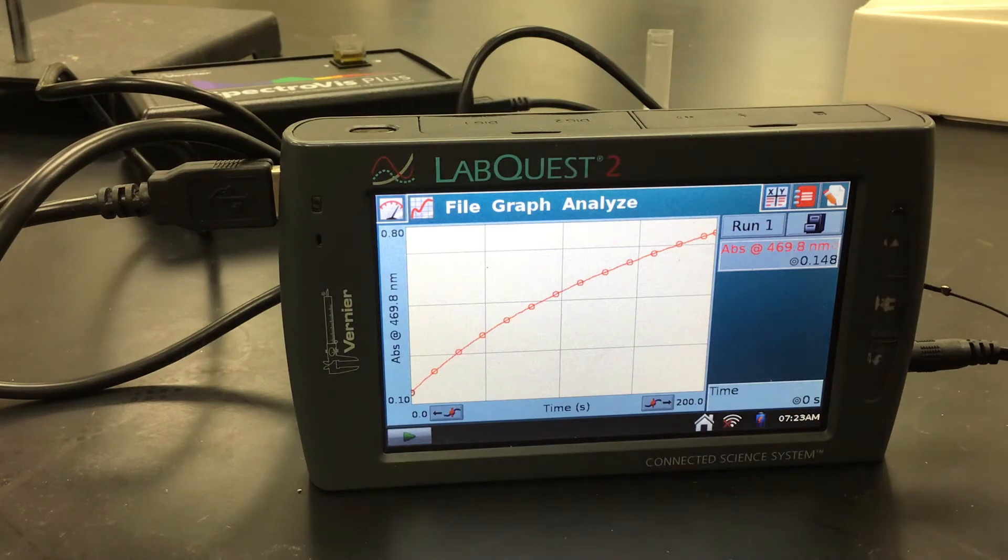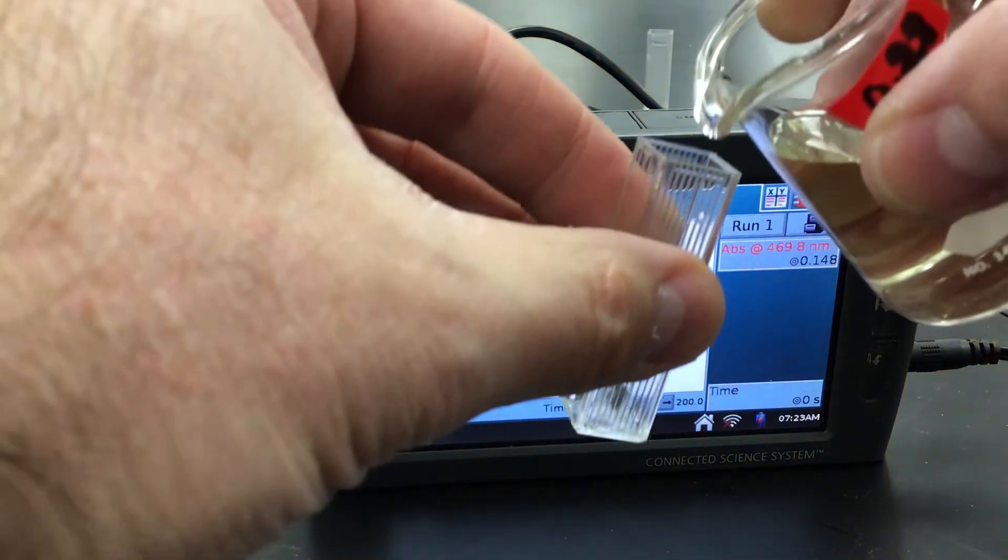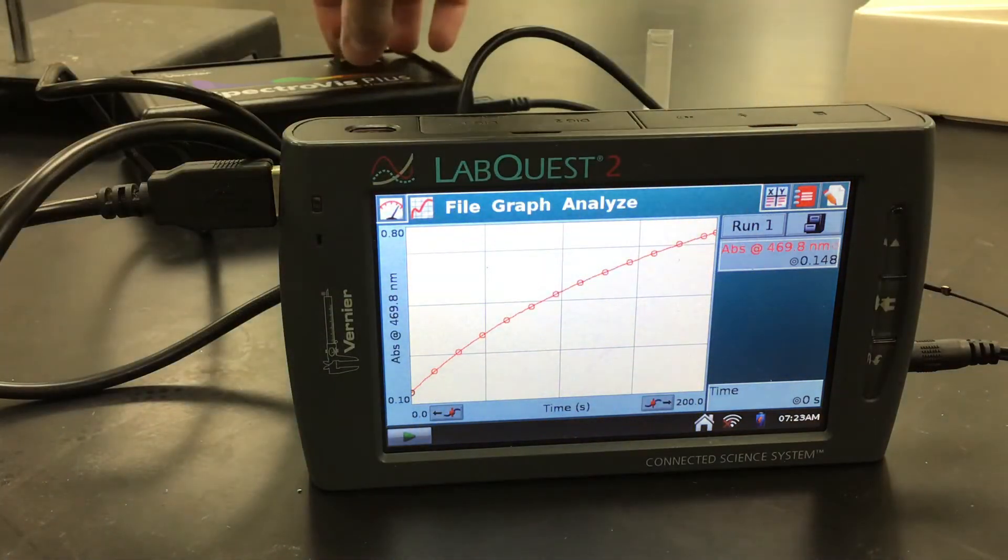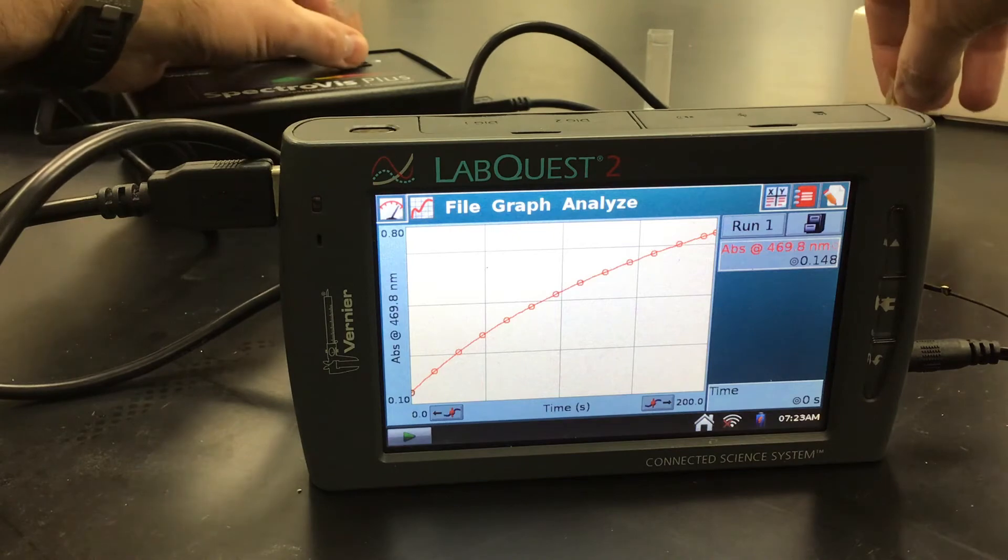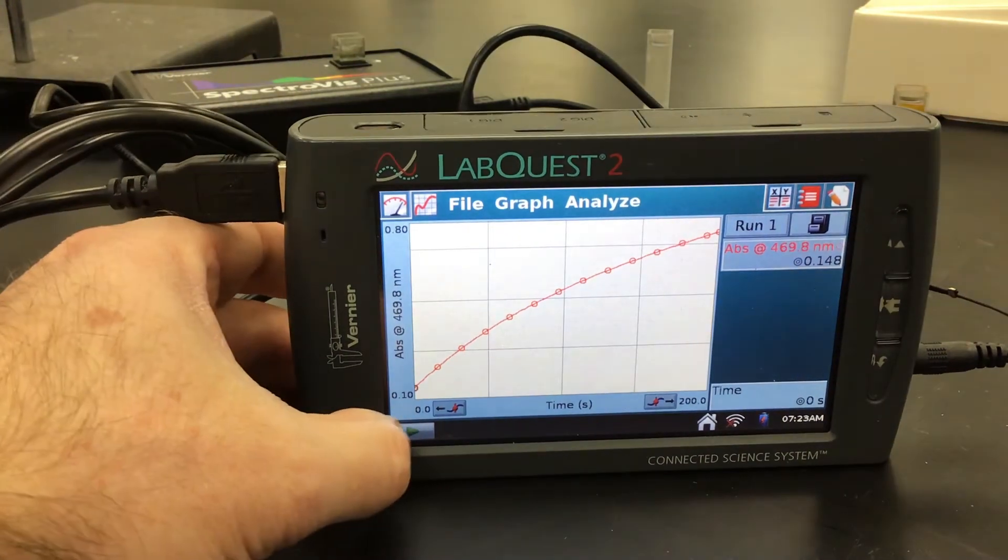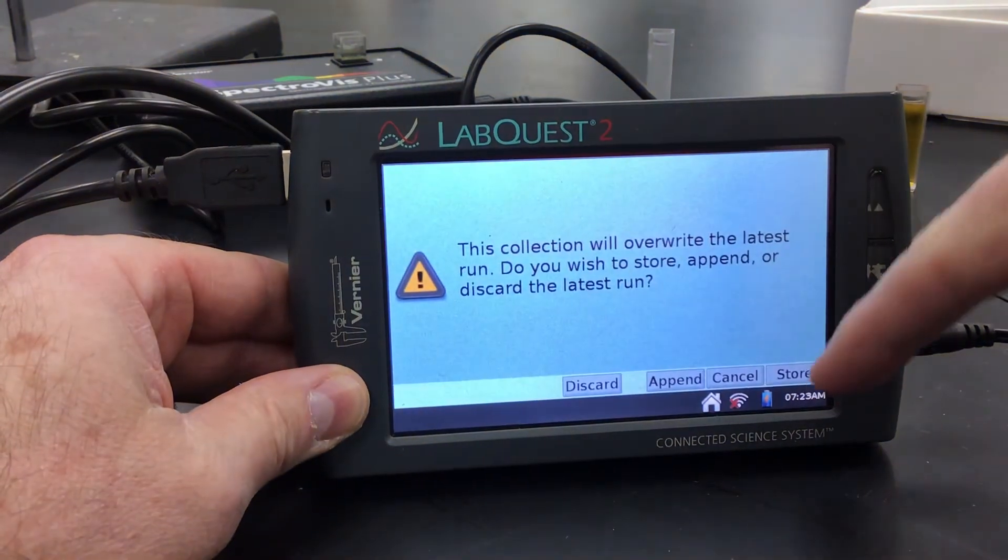Okay. So I've dumped them. I'm going to pour them into my cuvette. All right. Okay. We'll put this in our spectrovis. And then we're going to go ahead and collect this data and then we're going to store it.